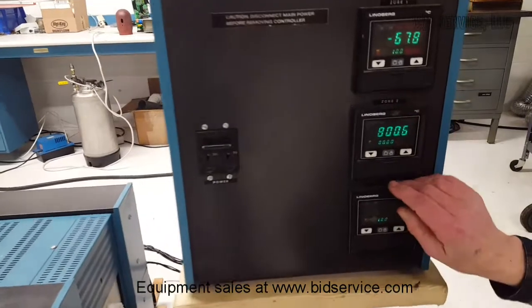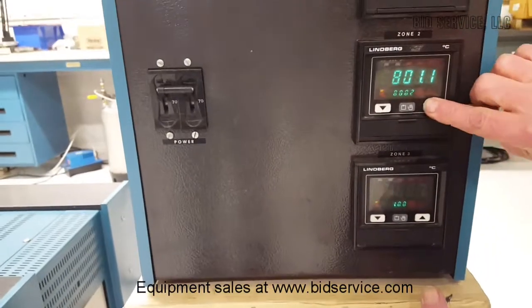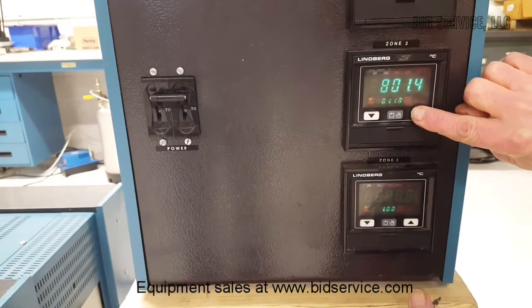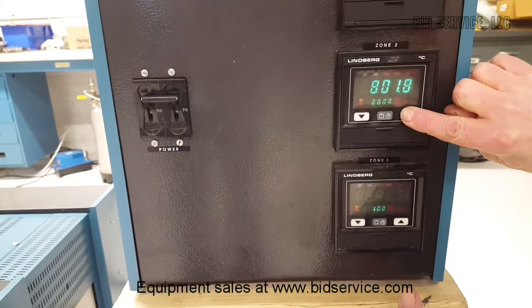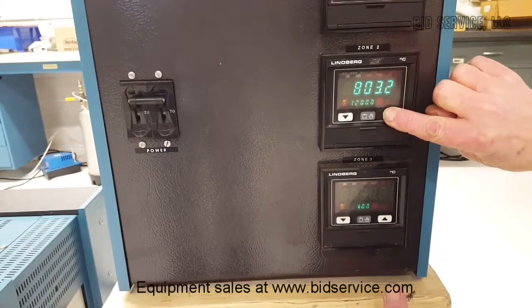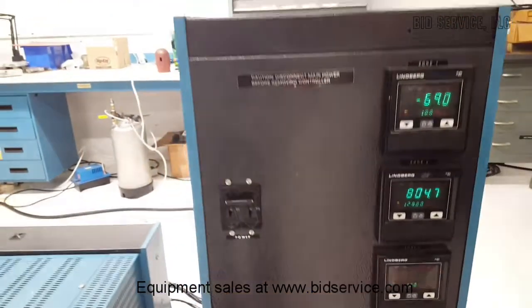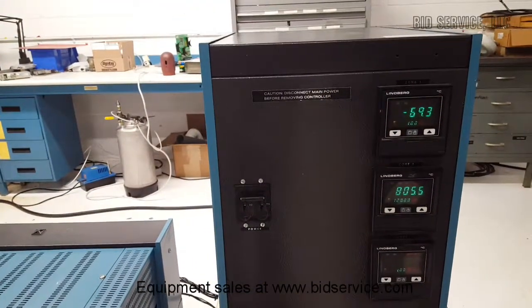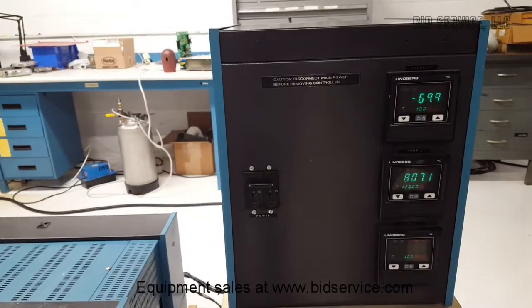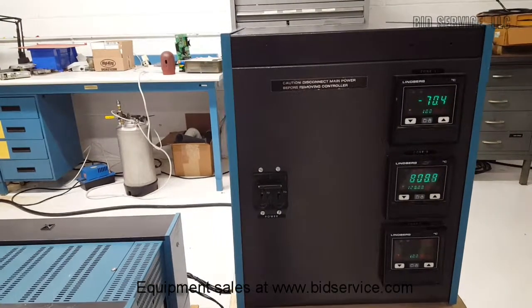Okay, we're back here for our last installment. We're at 800. We're going to run this up all the way. And there we go, 1200. And we'll come back again one more time once we reach our peak temperature, and then we will shut the system down, let it cool down, open it up, take a look at the heating elements.